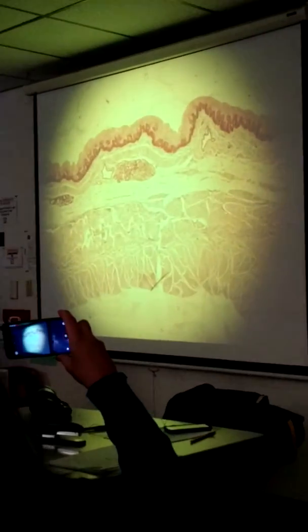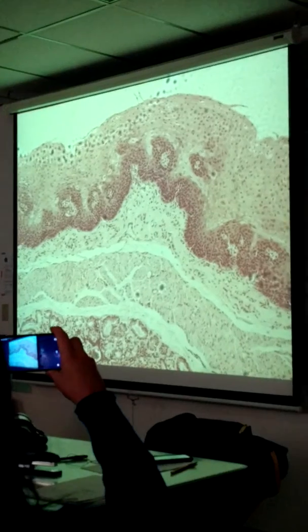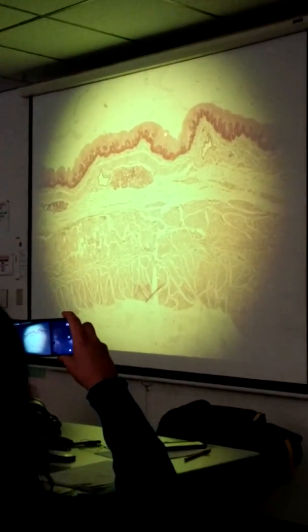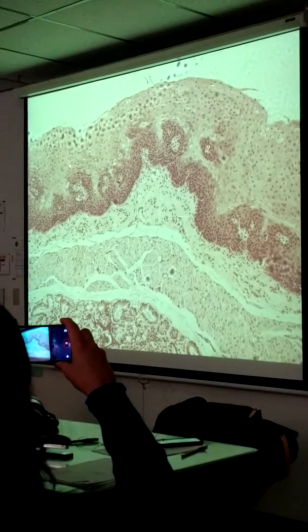Now you have two layers of muscularis externa, the inner circular and the outer longitudinal. Here's a closer up picture of just mucosa. So once again, here to here is mucosa, zoomed in. Mucosa, I might have to identify that tissue type from here to here.